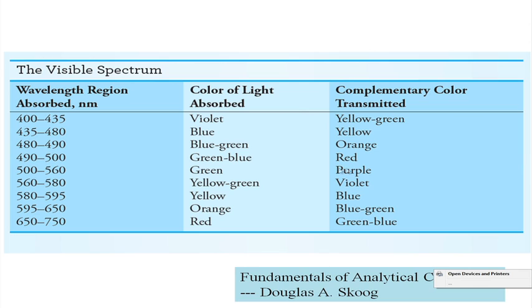We see only the red color, but visually what we are trying to detect is that, once you have the red, because these are all complementary colors, again the same color sequence is there, only your violet is now starting from here. So, again the whole range from violet to red is violet, blue, blue green, green, and then going back to yellow green, yellow, orange and red. So, instead of starting violet to red from here, you have to highlight here, and again you go back, go up and come over here as red.